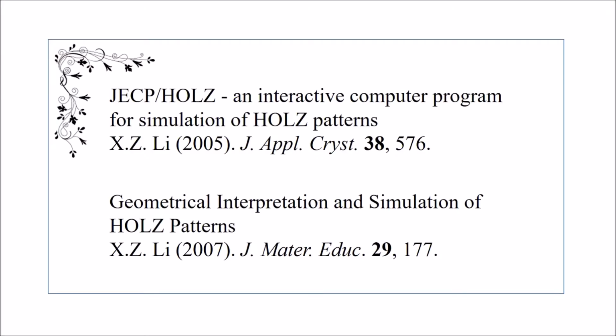A paper about the previous version of the software was published in the Journal of Applied Crystallography in 2005. The theory and formulas were presented in the Journal of Materials Education in 2007.